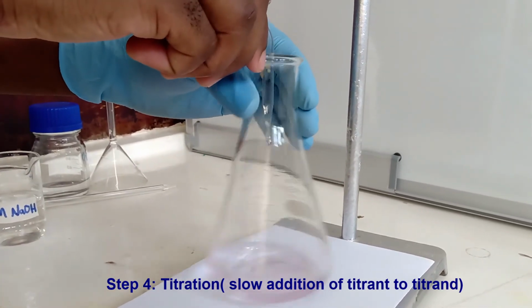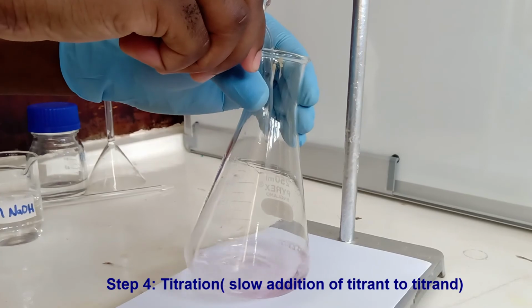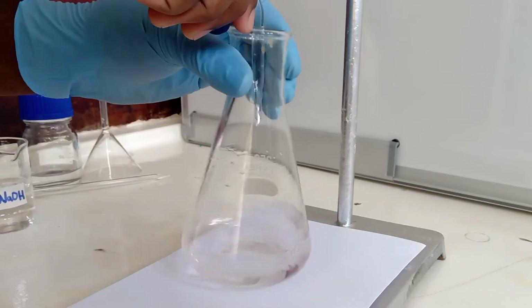The acid from the burette reacts with the base every time you add, until all the base reacts, after which the next drop you add makes the solution in the flask acidic. This is called the endpoint, and it is marked by a color change.